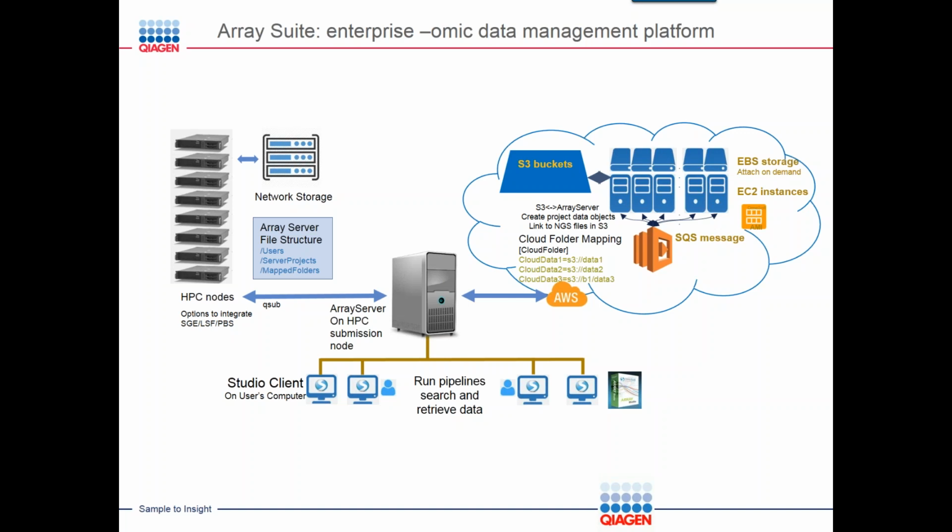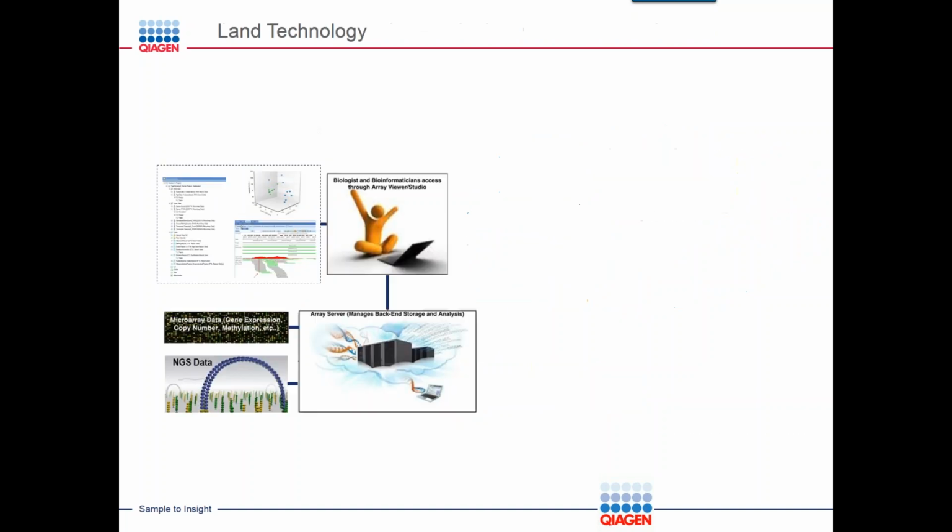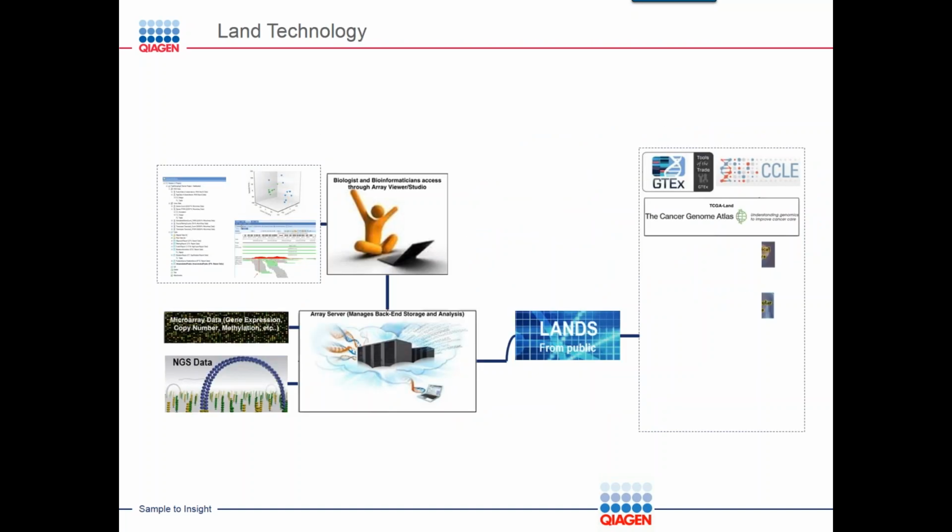And sometimes, if the user doesn't have a big data center or a big infrastructure, we also allow the user to use our hosted server, or use a powerful server to do the processing job. So this has been our framework, I think, since the release of Array Suite and also the release of our cloud extension.